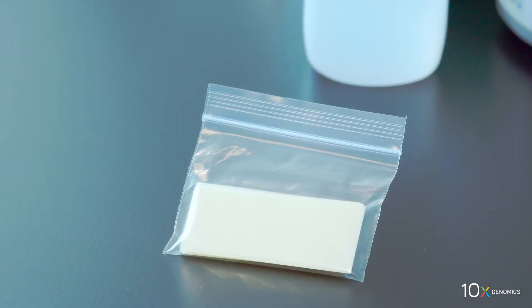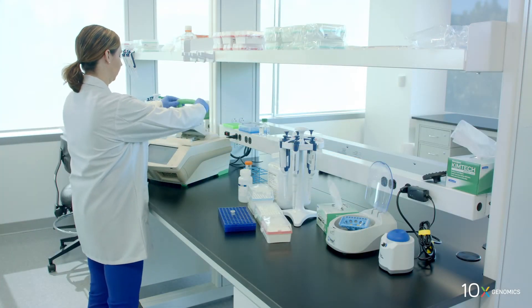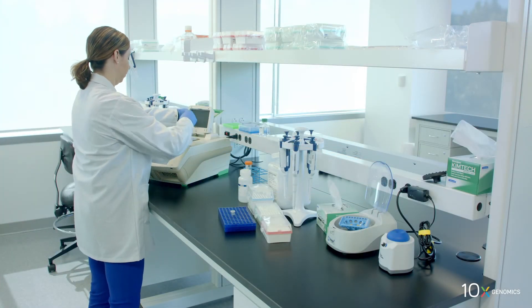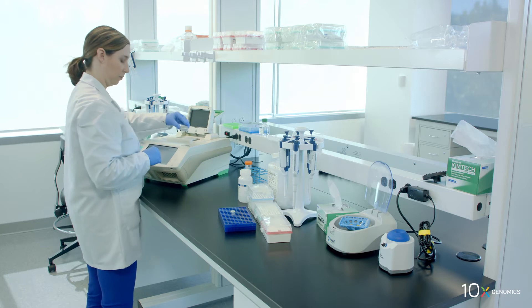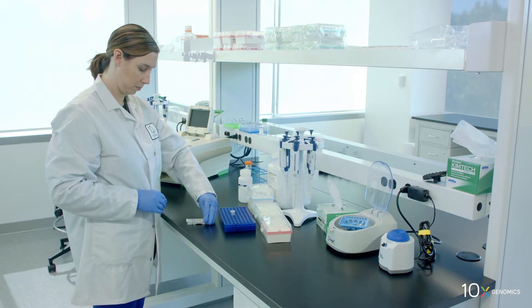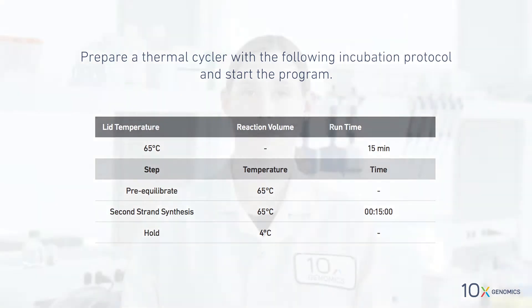Finally, we have slide seals. Remove the slide cassette from the thermocycler adapter and place on a flat, clean work surface. Prepare a thermal cycler with the following incubation protocol and start the program. We are ready to denature the captured mRNA.